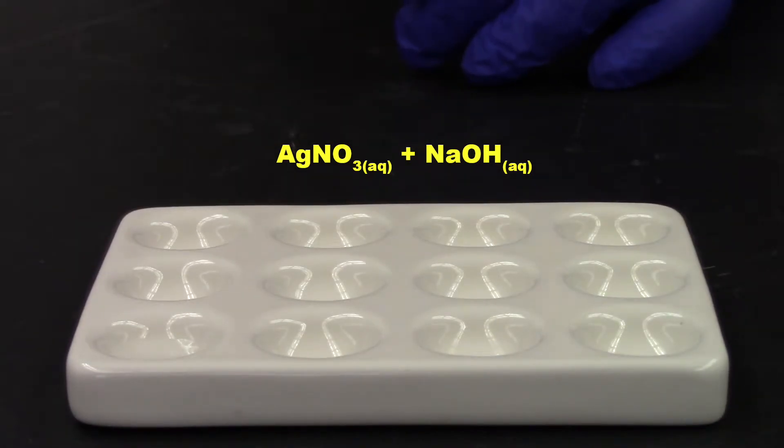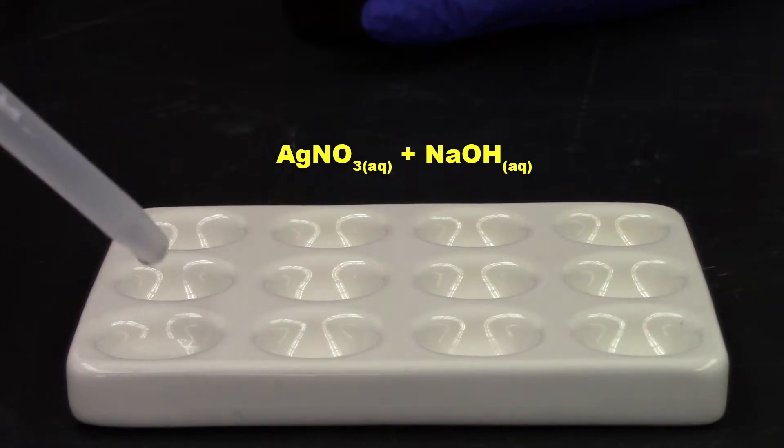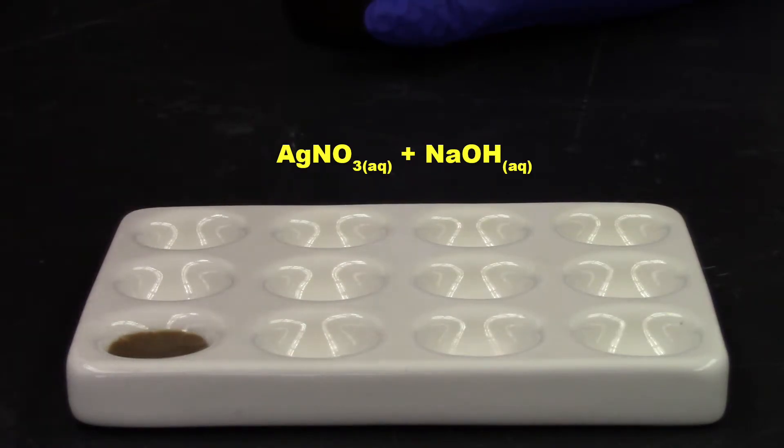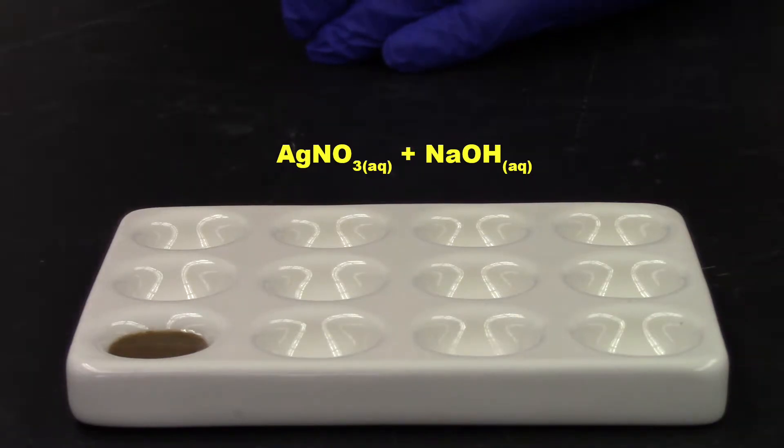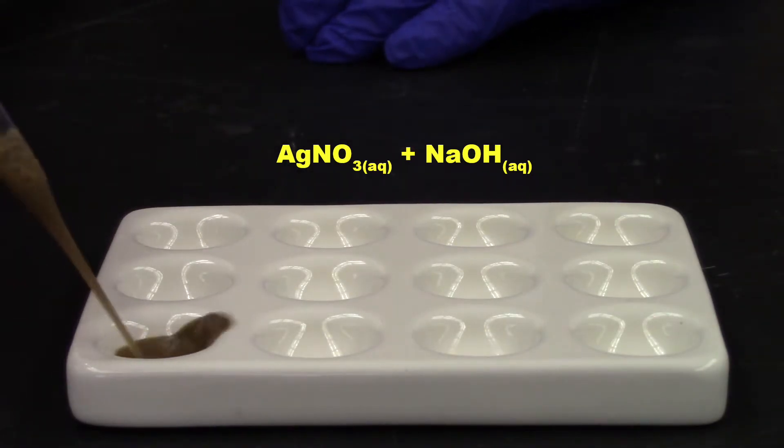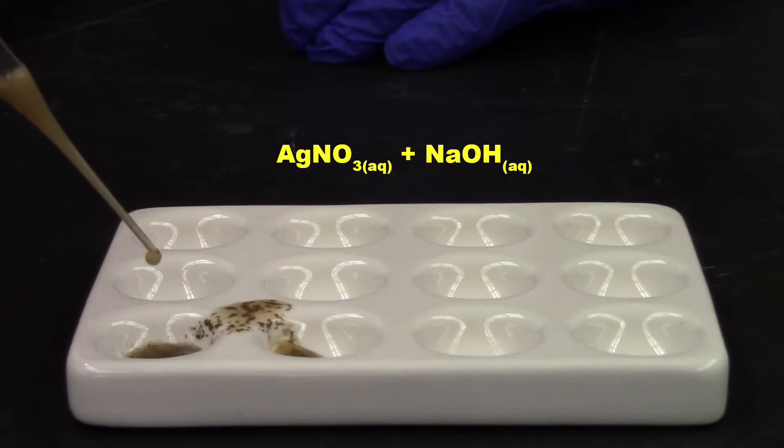And we'll add a little bit of sodium hydroxide. Now notice these are both clear, colorless liquids. And when I add them together, you get this. Let me mix them up a little bit. Whoops. Didn't mean for that to happen. But as you can see, you get a brown precipitate.